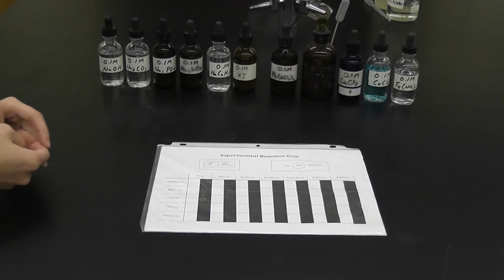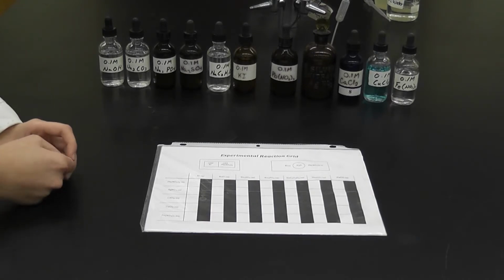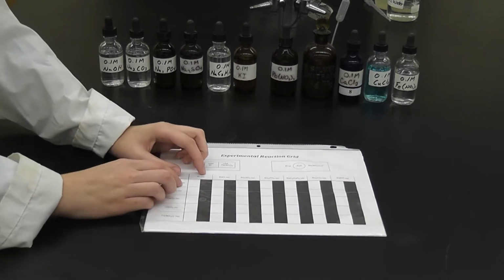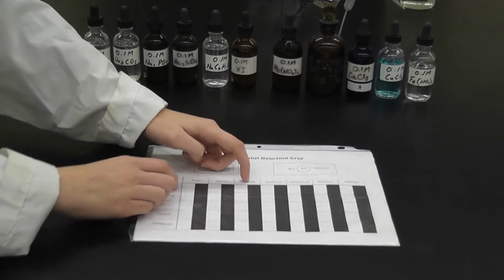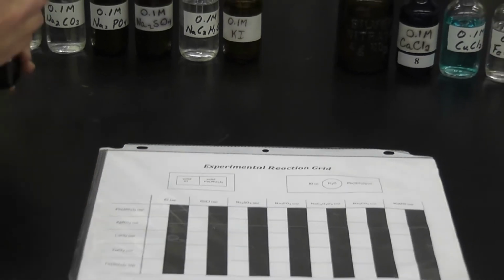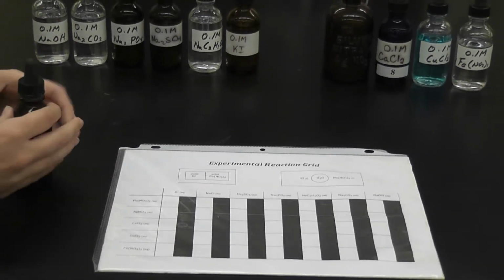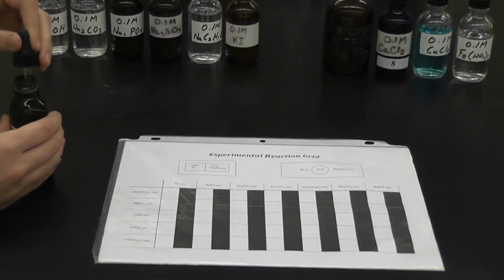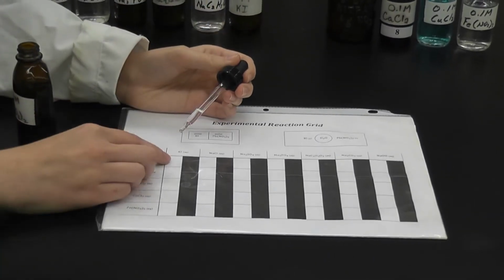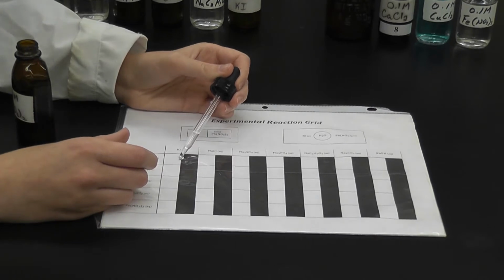Okay, so for part 2, we're going to be observing some aqueous reactions. So we're going to start using the laptop again, and we're going to match each one of these compounds or solutions together and observe their reactions. So we're going to start in this top left corner with lead-2 nitrate and potassium iodide. So we're going to add 1 drop of each right in between the white and the black.